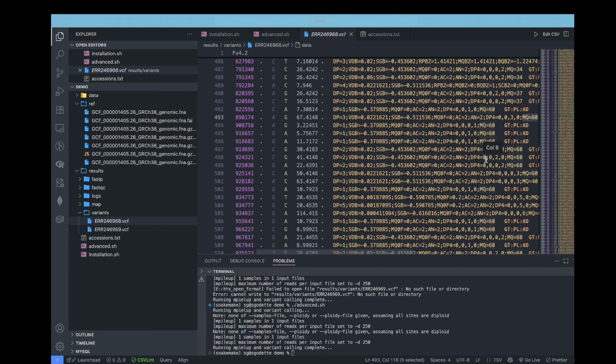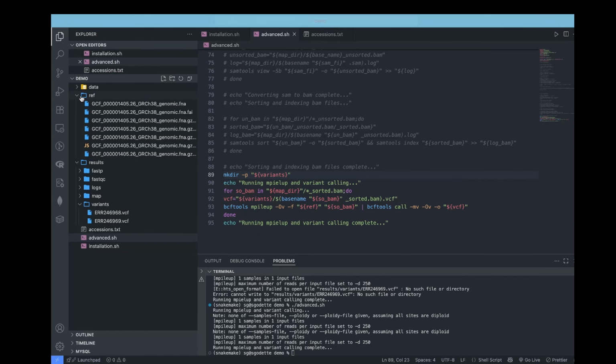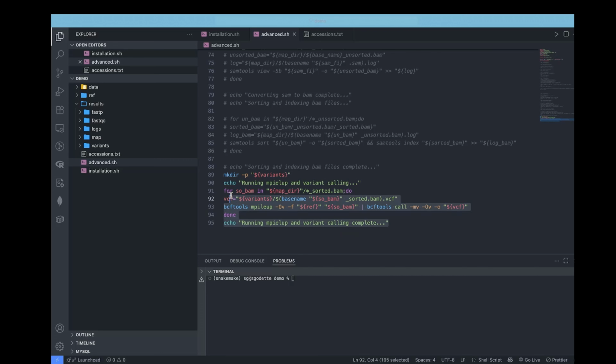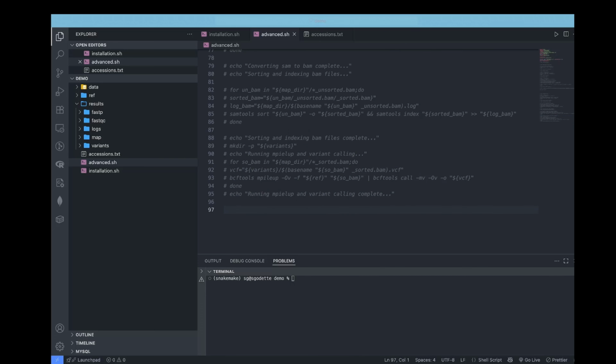During variant filtering, we will want to use some of this information to filter out our variants. And now let's go back to our main script to filter out bad variants. I will just close this and make sure the file structure here is much more organized, like that, and then also clear my terminal. I will want to comment out these sections. So for the command for filtering the variants, we just need to write a for loop for VCF in the variants directory.